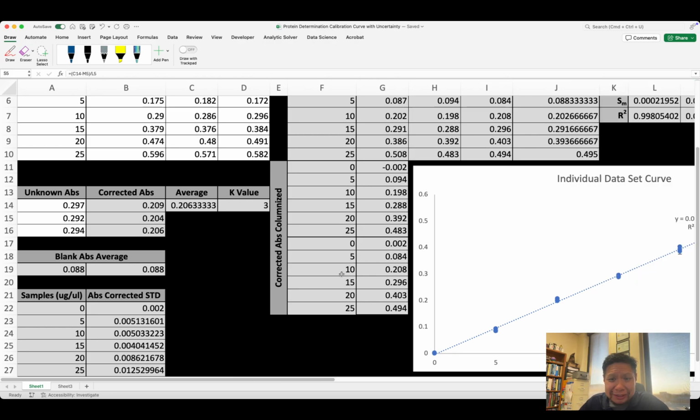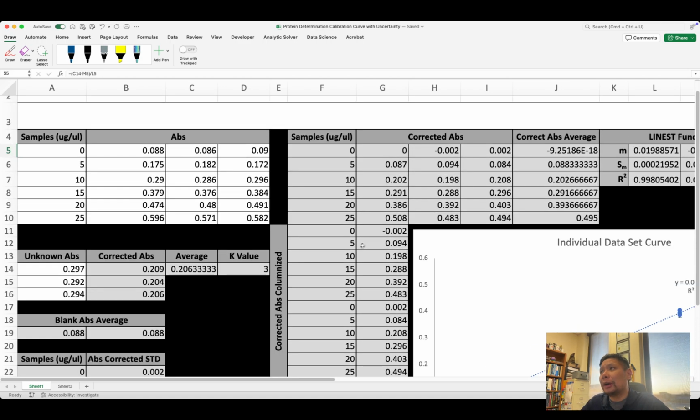But once you do it once, you can use this for every single calibration curve, for anything in my class, like exams, for your research, for lab, for anything. I actually use it. You can use it in industry too when you go to get a job. It's a super helpful Excel file.